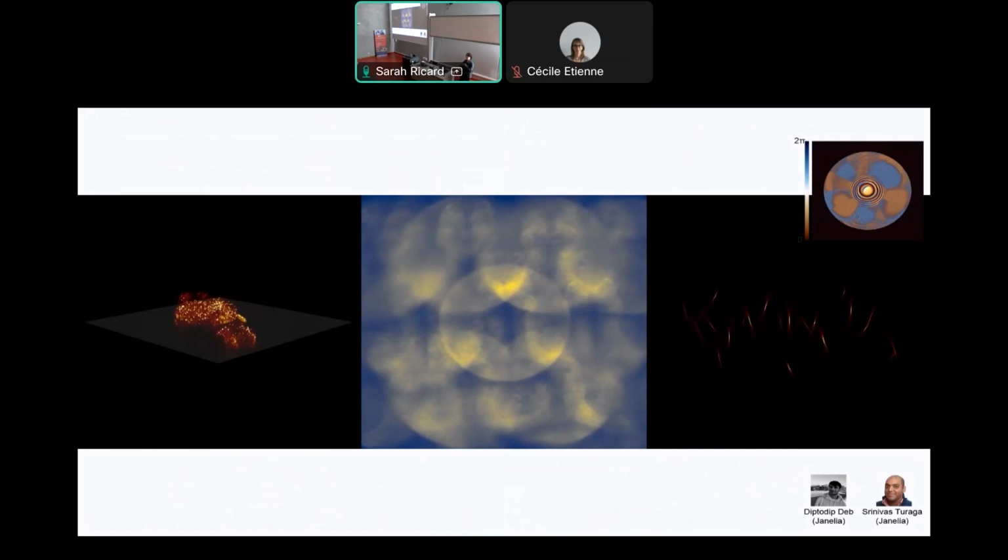So now we can compress the number of measurements that we take. Usually when we want to image a 3D volume, we have to take one image at one plane, move, take one image at another plane, and so on and so forth. You can imagine that when we're imaging fast processes like action potentials, that's not going to work, because by the time you get back to the first plane, your sample has already moved and another action potential has fired. Your temporal resolution is too slow. What's happening here is that all of the 3D information is being encoded onto your camera at any given instant.